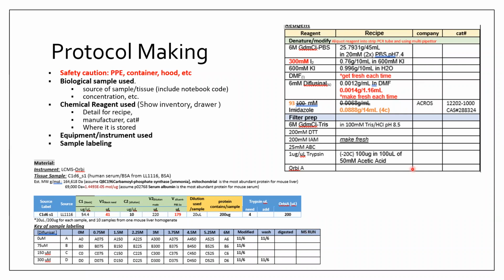This part is the materials you are going to use. Plan it really clearly and in detail, so you know what you're going to have. Of course, we are biochemists. We study biological differences between samples. So are you going to use any biological samples?